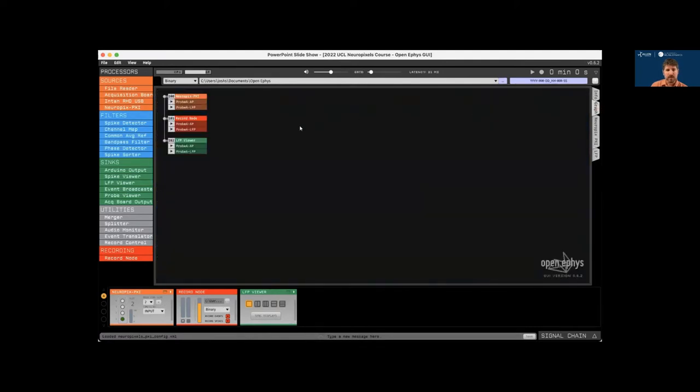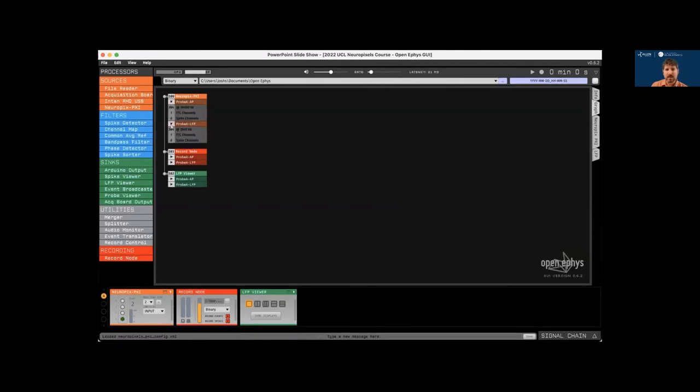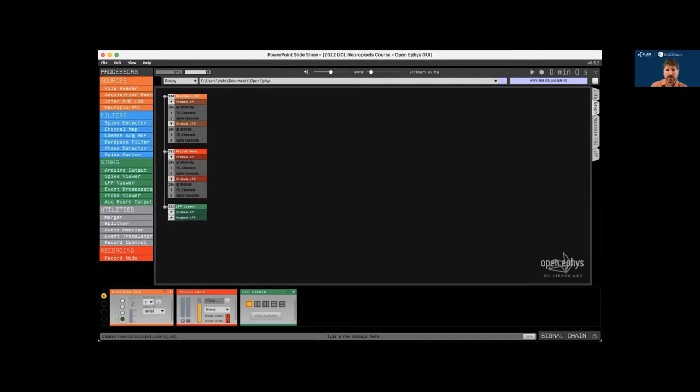And once the signal chain loads, you can see the plugins that were added in the editor viewport at the bottom of the window. And then we switch to the graph view. We can see all of the data streams that are being handled. The Neuropixels plugin generates two data streams, one for the AP band and one for the LFP band. And these propagate through the rest of the signal chain into the record node, which writes the data, and the LFP viewer, which is used for visualization.